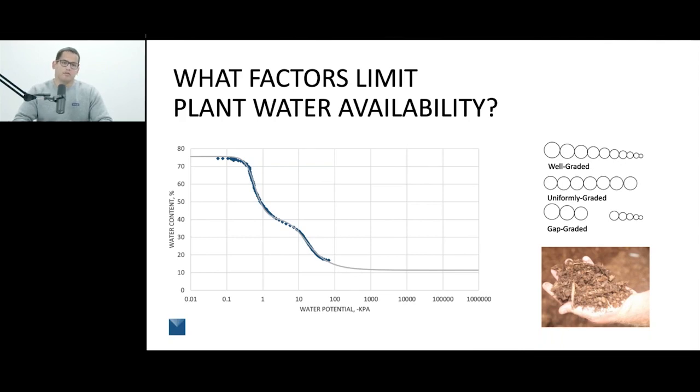So this was a really interesting application of how we utilize soil moisture release curves to understand the impact that this material had on plant water relations. And now we're seeing a broader use of the soil moisture release curve to better understand different soilless media mixes, and to refine and optimize these mixes to make better decisions and make better media to grow plants in.